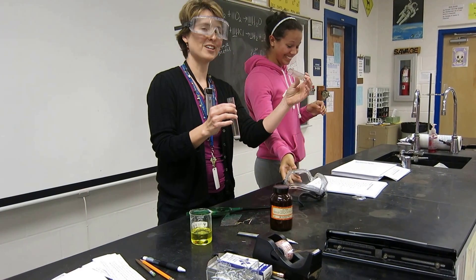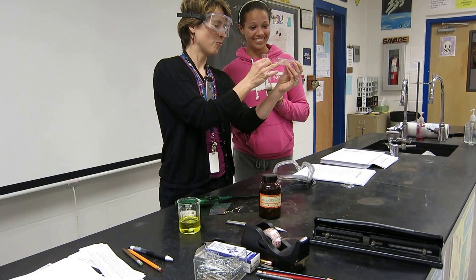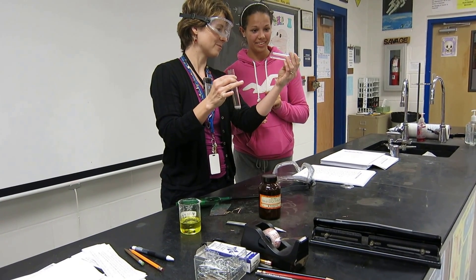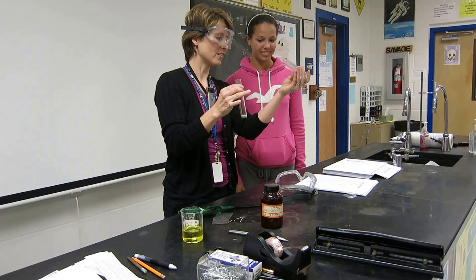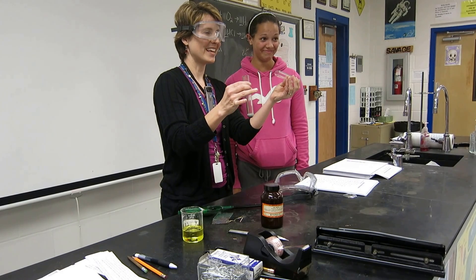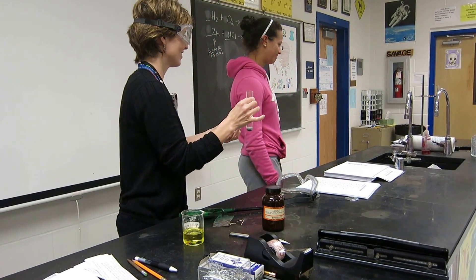Now Ashton, before you run off, what do you see inside the test tube that's stuck to the inner walls? Like steam or water? Water. She sees water all on the inside that's condensed. Because what did we make in that last reaction? Water. All right, let's give her one more round of applause. Thank you.